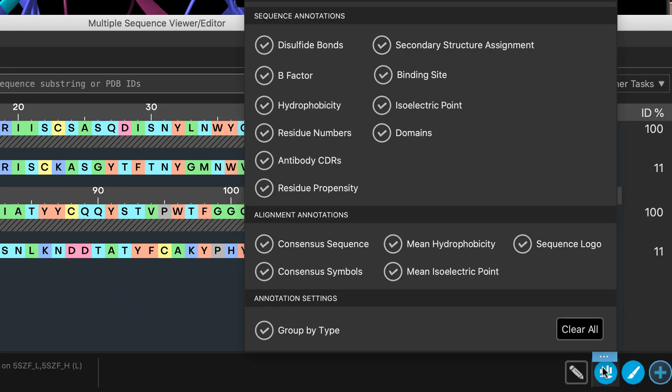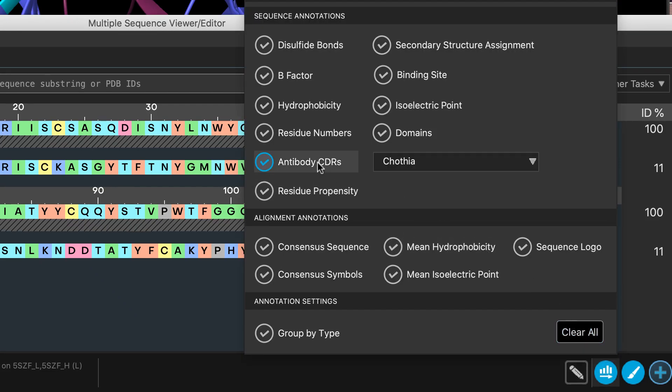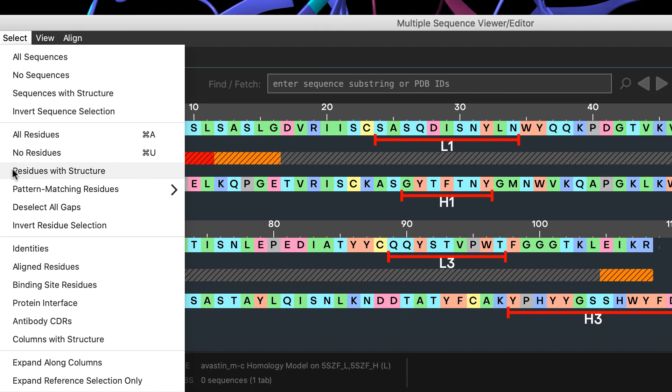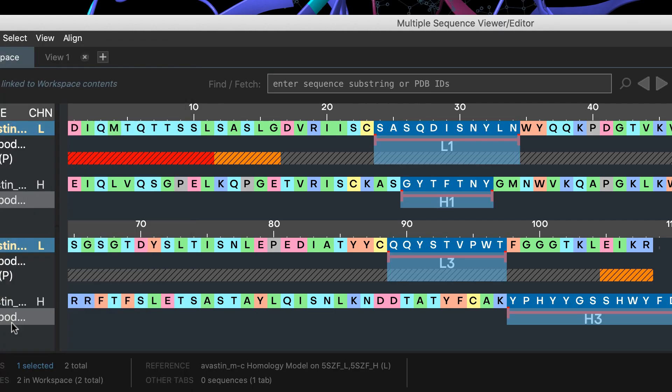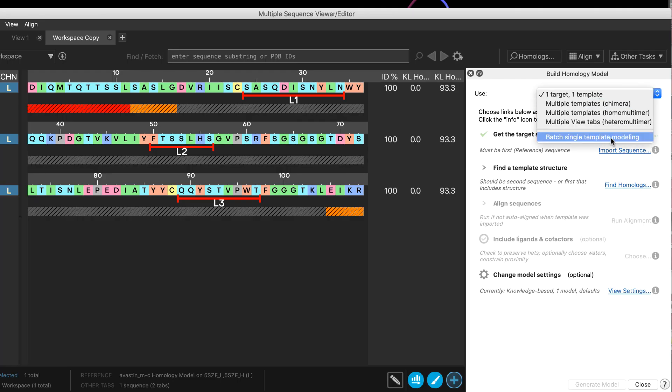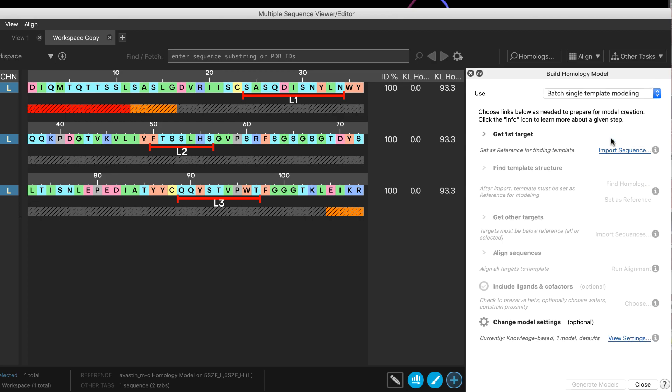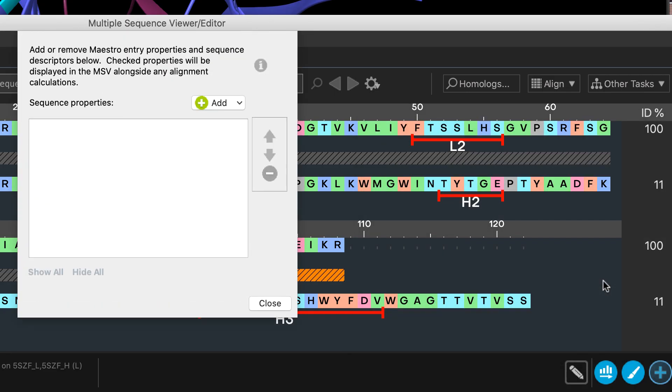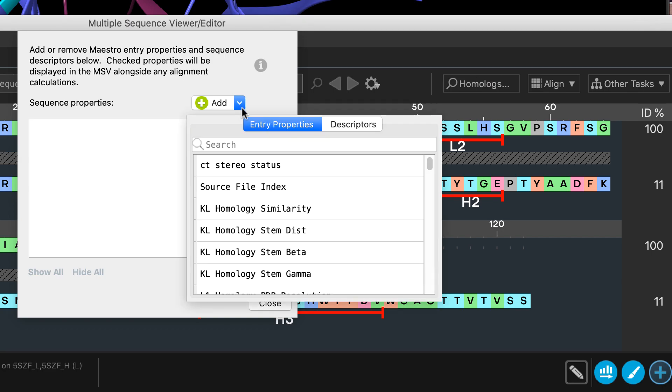Notable new highlights include improved antibody annotation and selection, new batch mode for homology modelling, and easily display sequence descriptors or properties in the new metrics column.